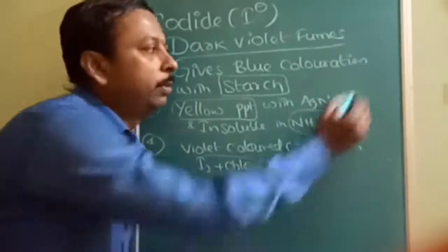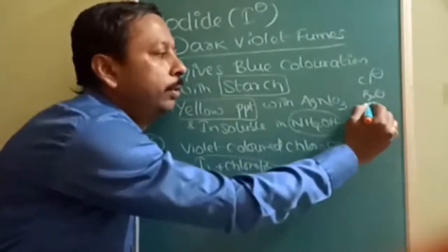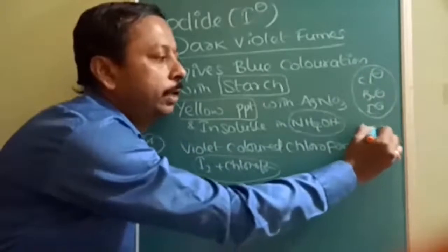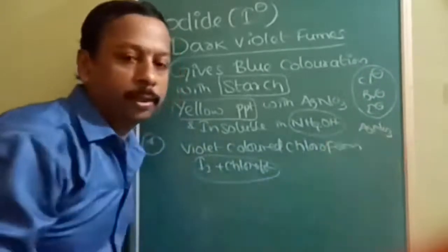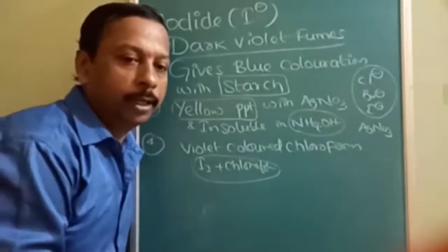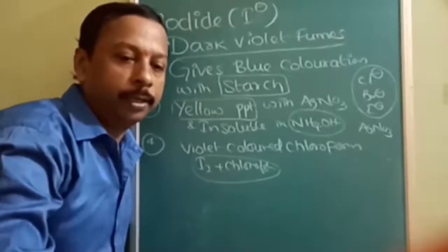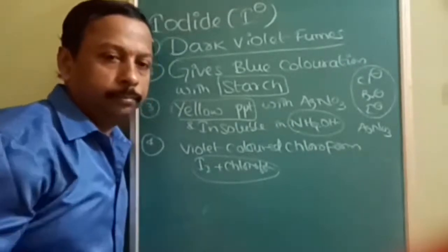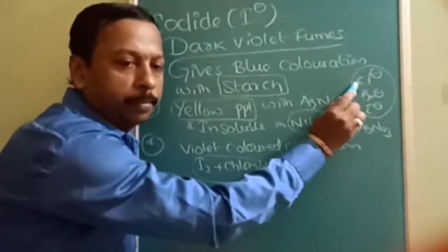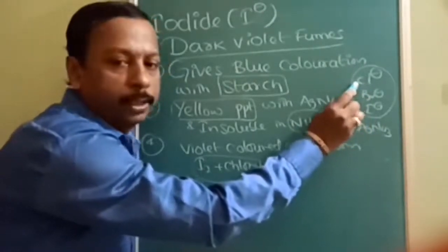The main problem with chlorine, bromine and iodine is the similar color obtained when reacted with AgNO3. All are similar: yellow, light yellow and white. Pure white is Cl minus. If it is completely white and completely soluble in NH4OH, it is Cl minus.